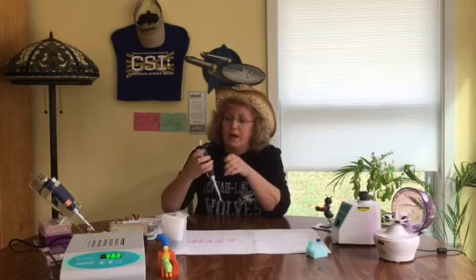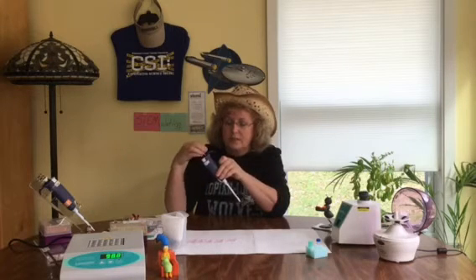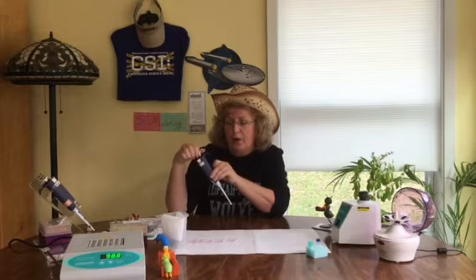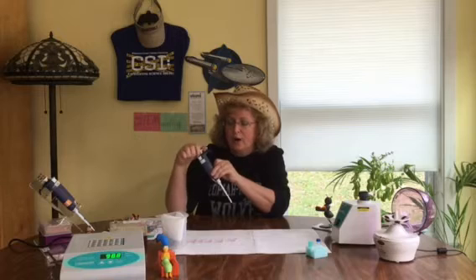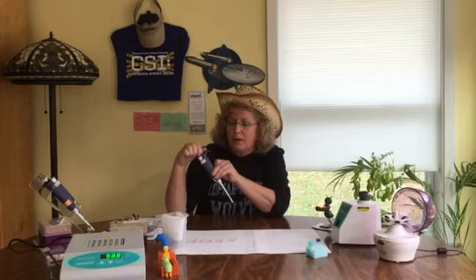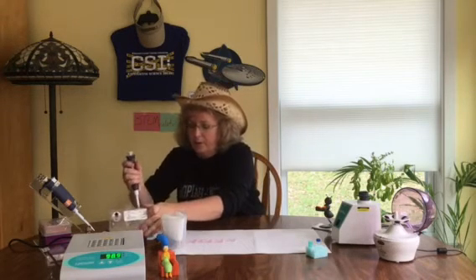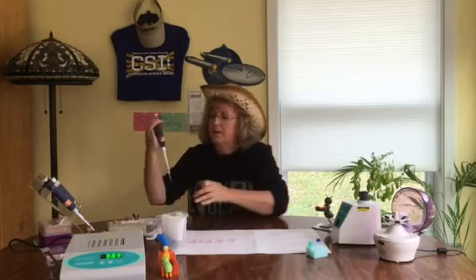We definitely do not want it proceeding to the PCR step. Okay, so I need 50 microliters. So I have to dial this down to 50. What will it show in the screen of numbers? It will show 0, 5, 0. That's on a P200. And of course, having other people helping you, they could have already had that dialed for you. That would have been great. 050, 50 microliters.